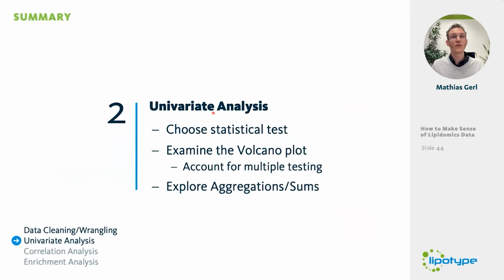So we have the rule with univariate analysis. So you need to choose your statistical test.